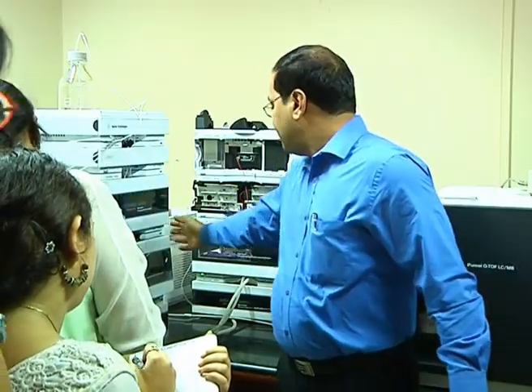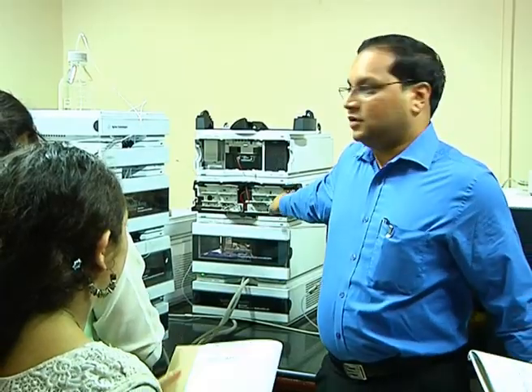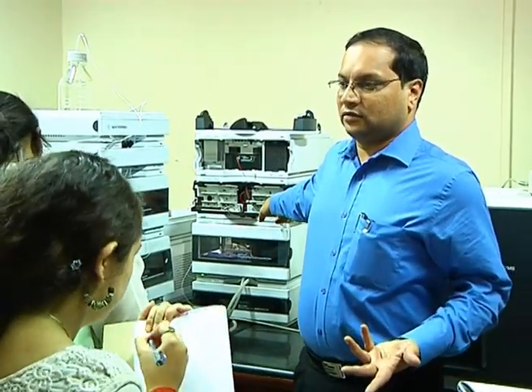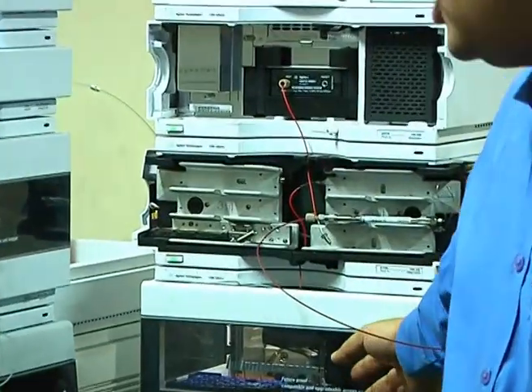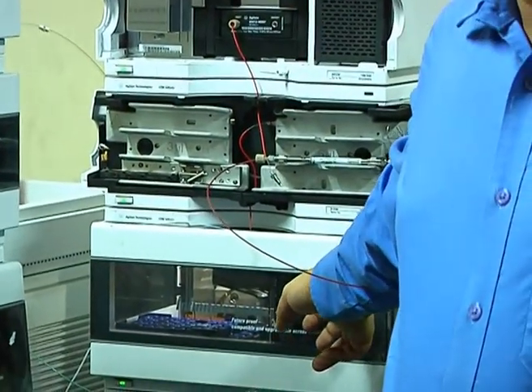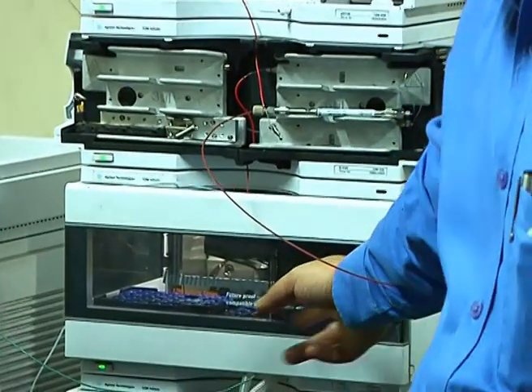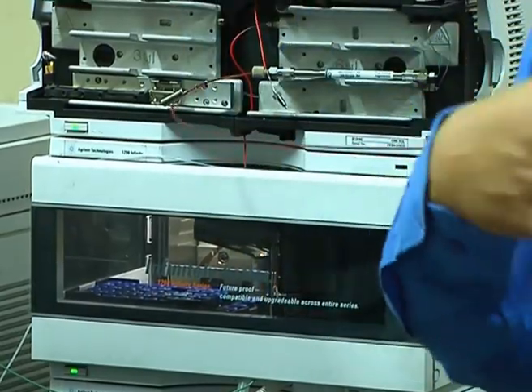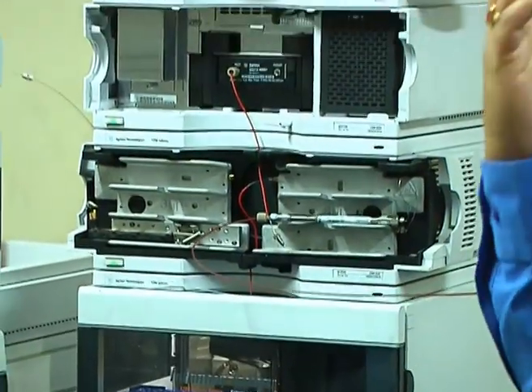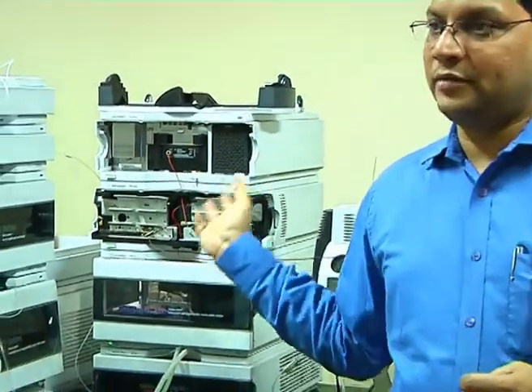We have the pump, then a column compartment where you put the column. Typically it's heated, so you can have better separation. Then you have an autosampler. If you recollect my slide, where I said it can be automated, you can put hundreds of samples in it, define your runs, and carry out your other work, and by the time your analysis gets over, it is automated.